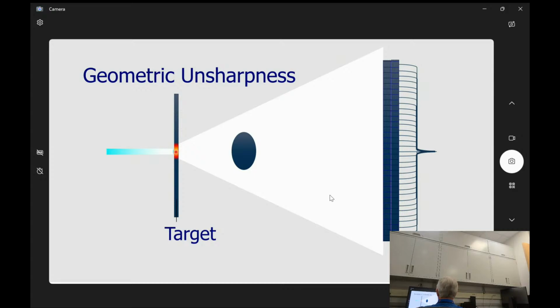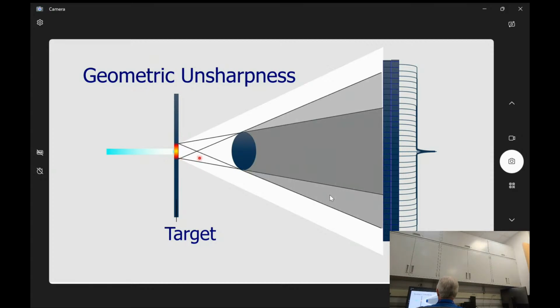So I don't want to do that, and thus usually when we're going to higher energies, we're getting a bigger spot size. The problem with that now is that we're getting rays from either side of the spot, and when those rays end up crossing the edges internal or external of the sample, they fall over a wide range of pixels, and that means that the edges appear to be blurry. And again, that makes it really hard to segment anything later.